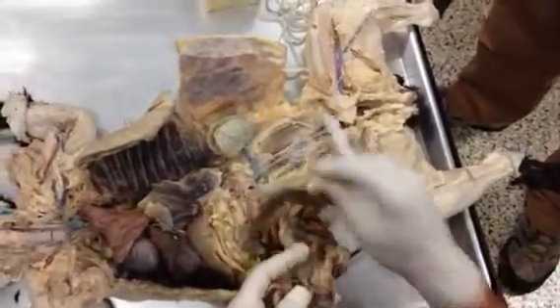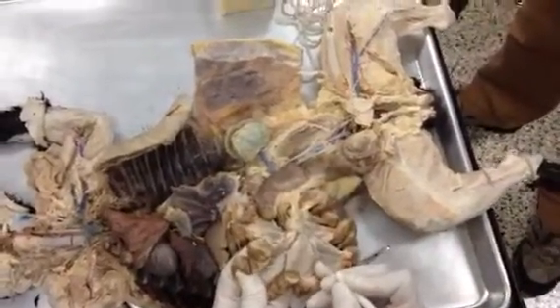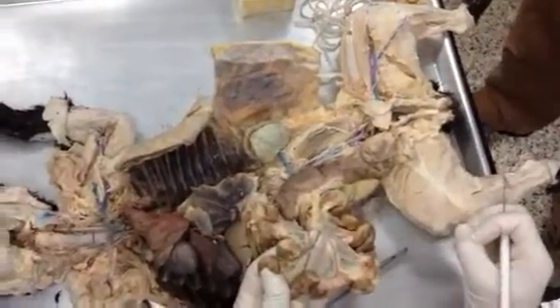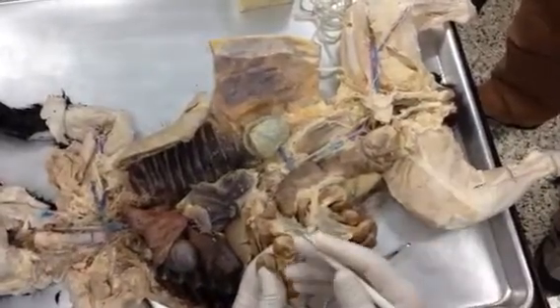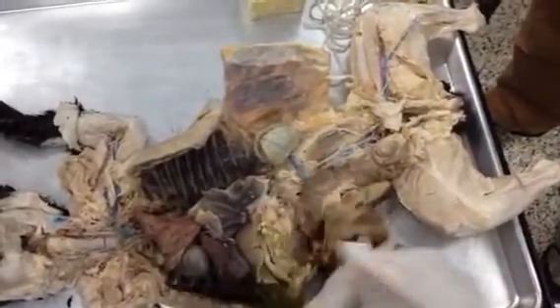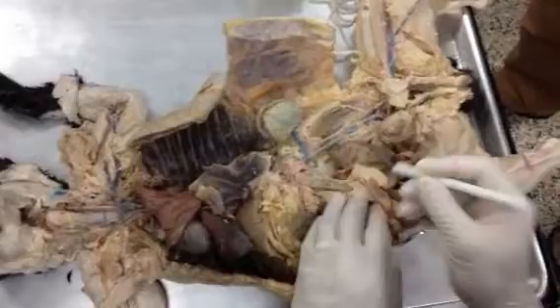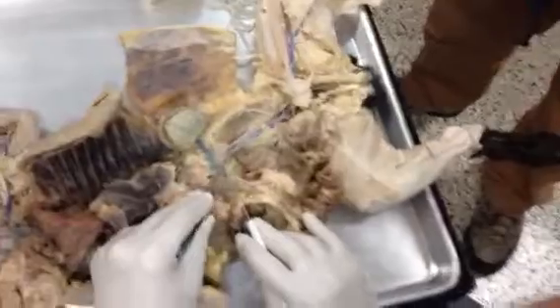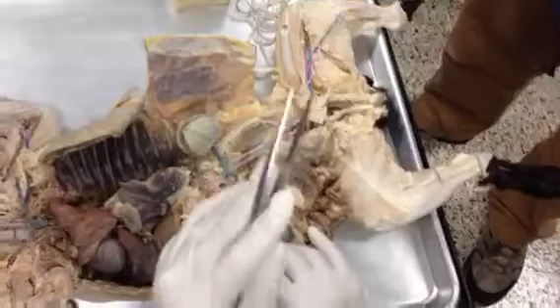Okay? Now, these brown blood vessels right here, those are branches of the hepatic portal vein. Hepatic portal vein. Portal, something beneficial. In this case, nutrients. So all of my nutrients, my glucose, my amino acids here, all are going to be transported via the hepatic portal vein to the liver. And there, folks, is the hepatic portal vein right there. So there's my superior mesenteric. There's the hepatic portal vein running up to the liver. It's a vein, deoxygenated blood.